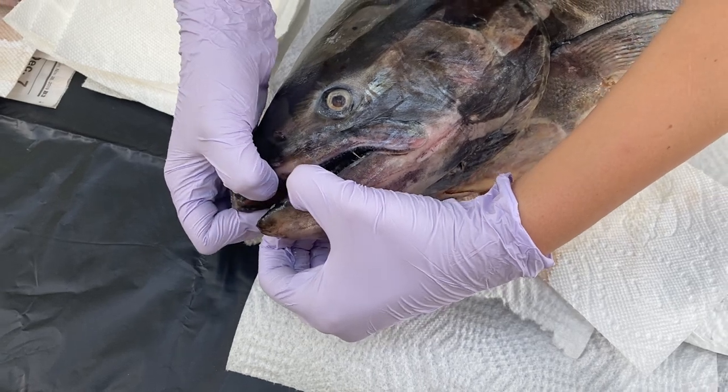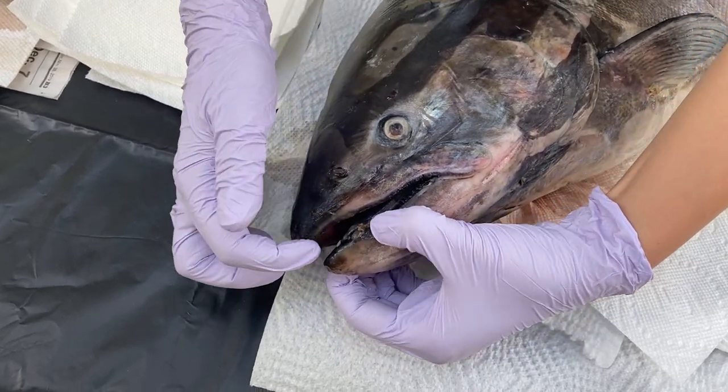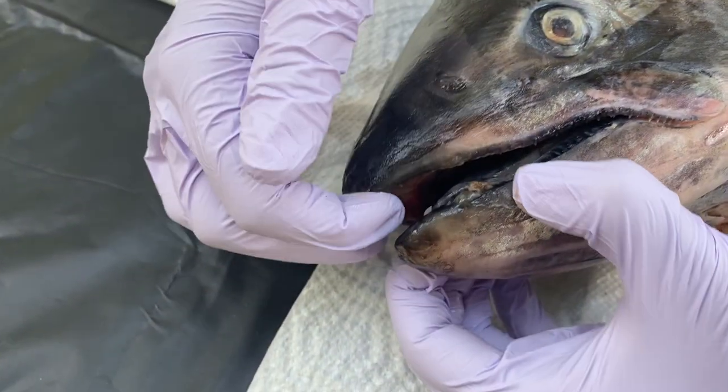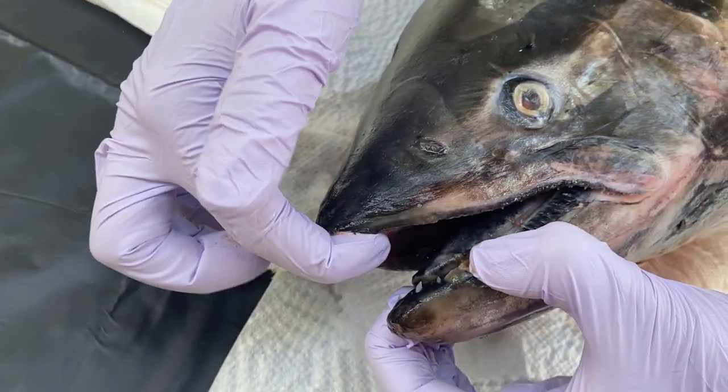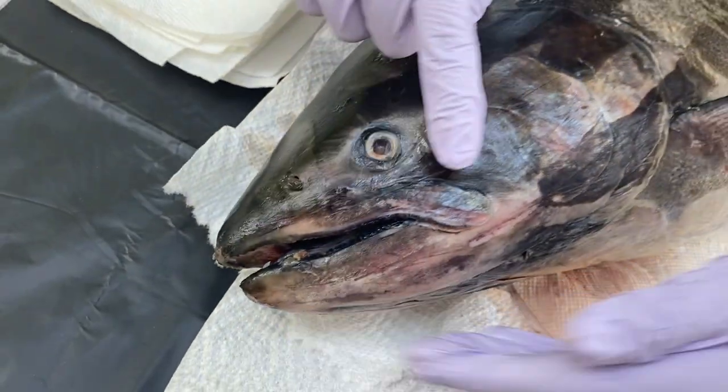We can go inside the mouth and we can see that they have these rows of teeth, and they also have a black tongue, and there are also teeth on the tongue. And then we'll move up.